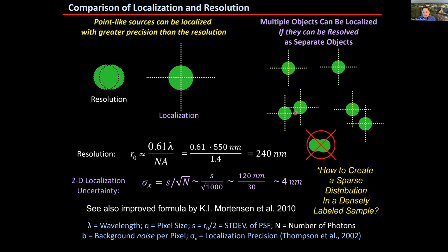So we could find where these molecules are plus or minus a few nanometers as long as they're well separated. That doesn't give us an image because it only provides a few localizations. If they're too close together in a system where we have many molecules, then this whole process will break down.